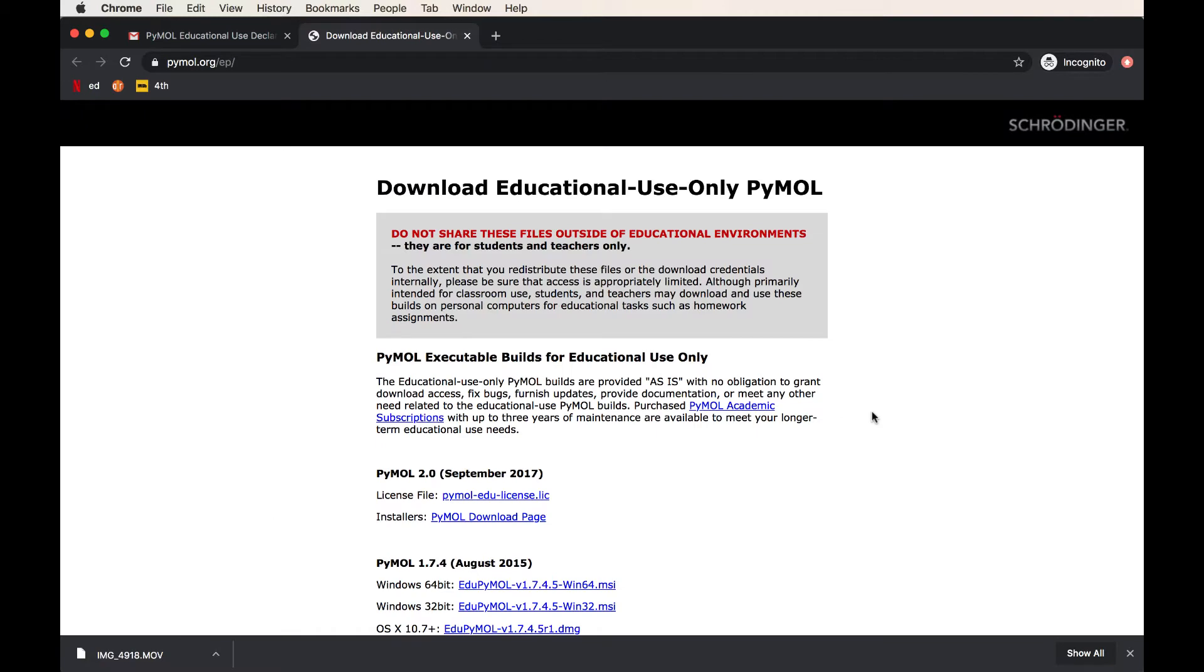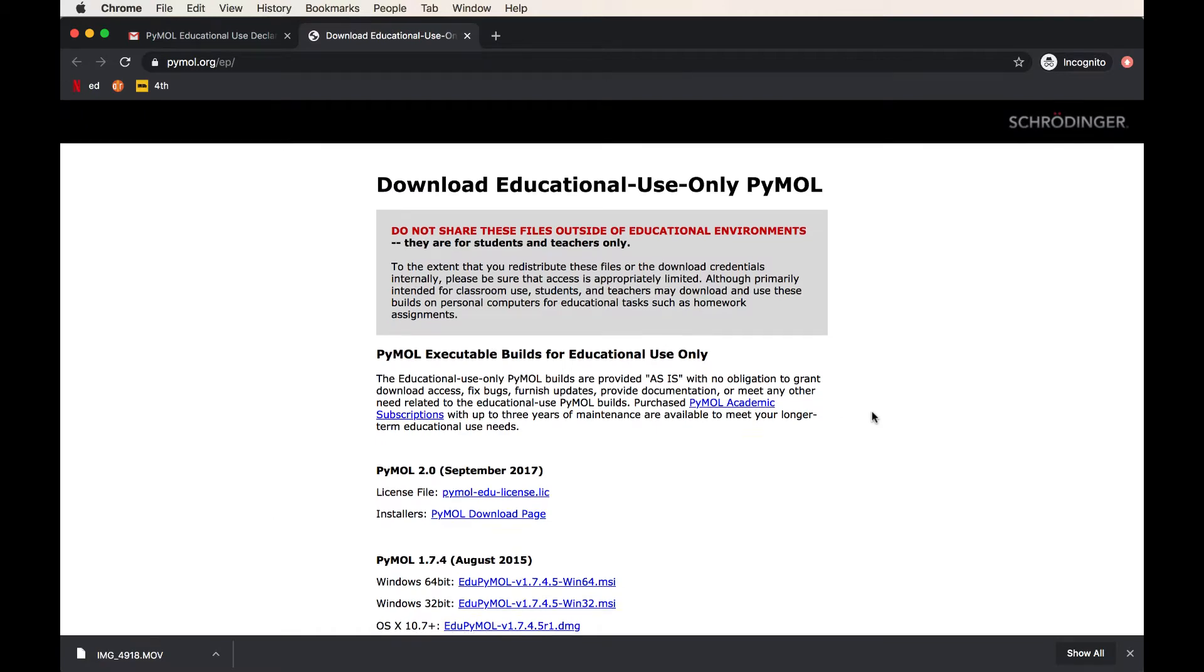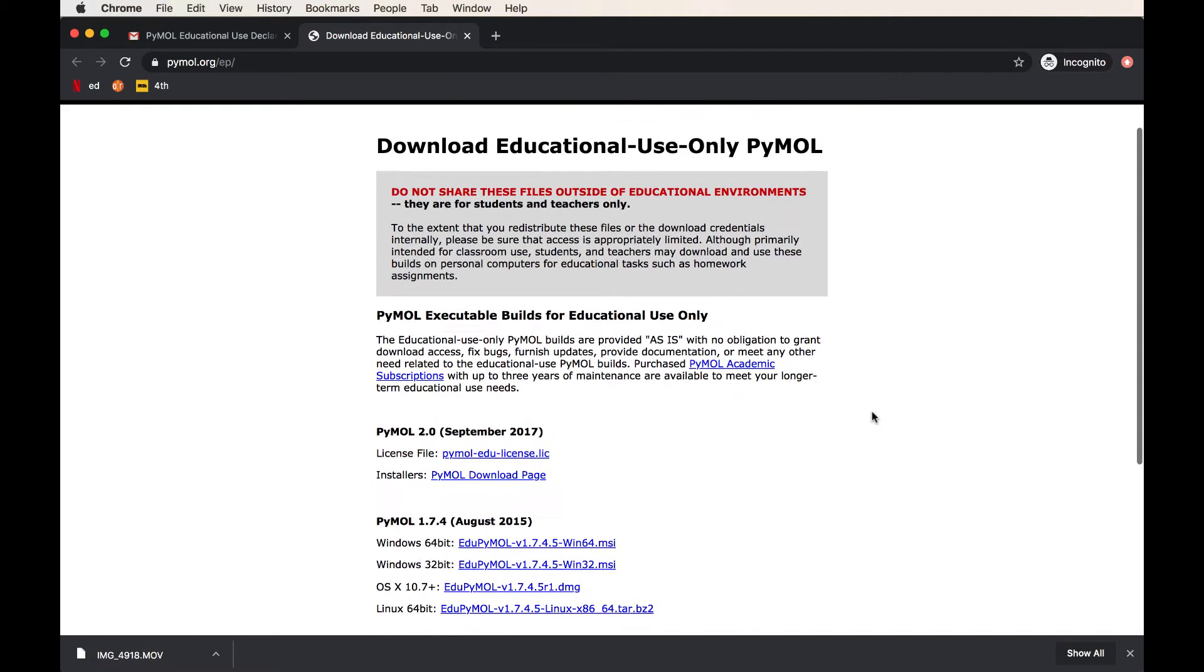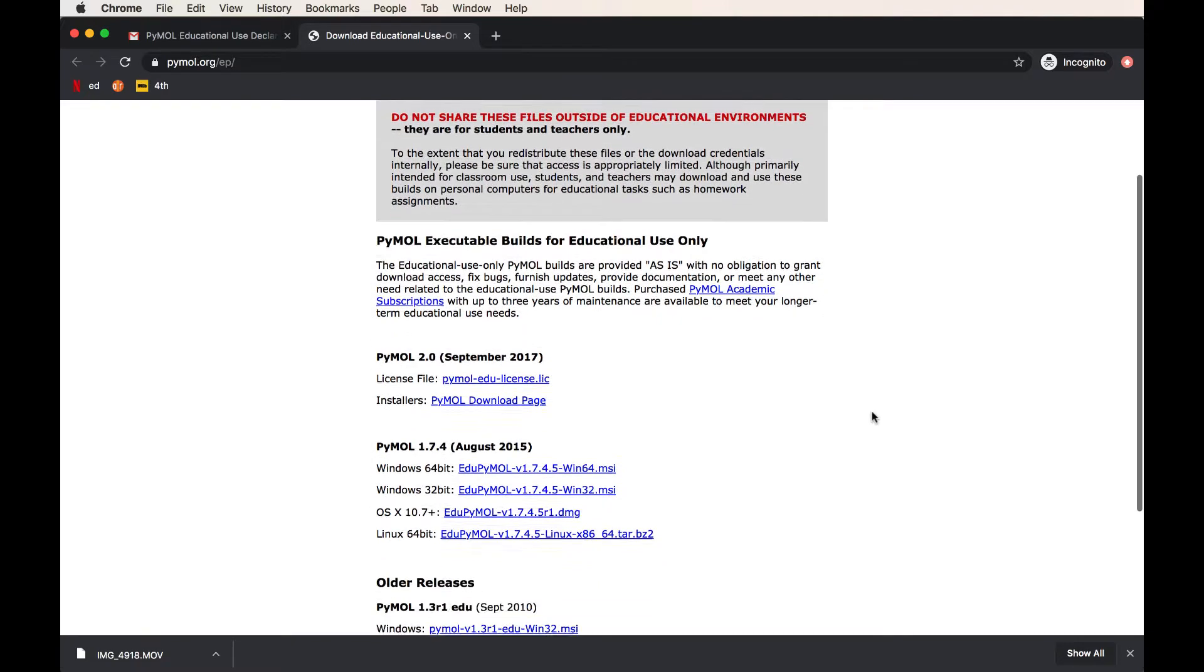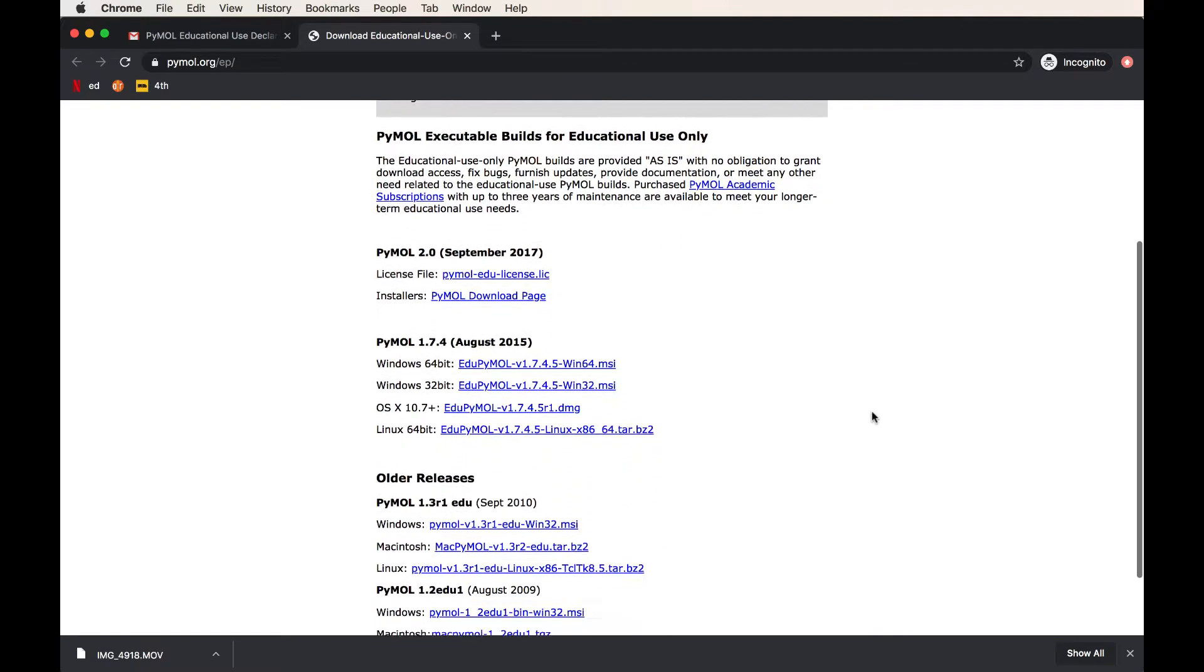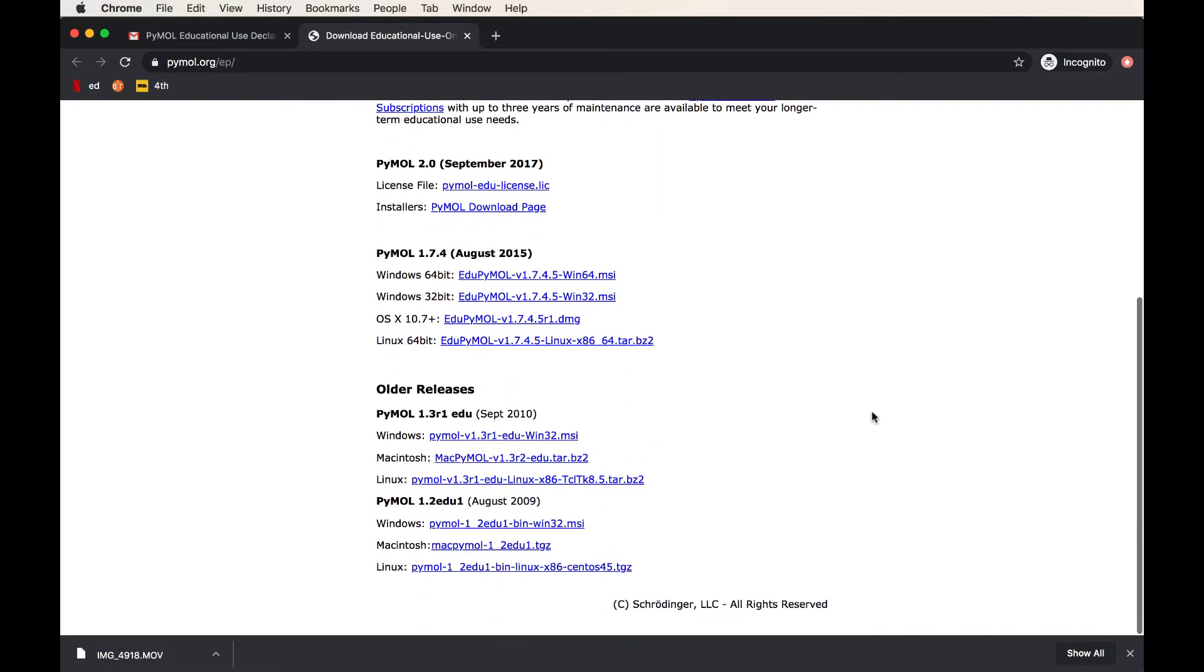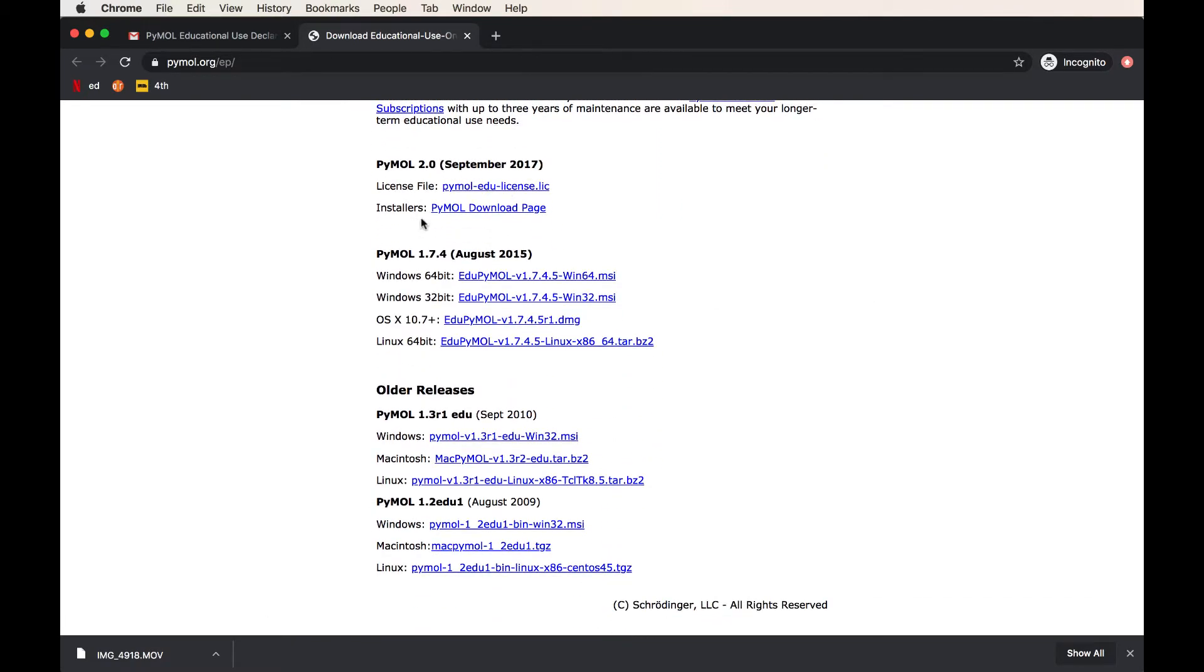Once you enter your username and password, you'll be given access to the download page. Here, you're going to see all the different builds which are available. There's some newer builds, PyMOL 2.0, which was released in 2017. And there are also older builds. The older builds work just as well as the new one, but the new one actually looks a little bit fancier and has some shortcuts in your molecular rendering.